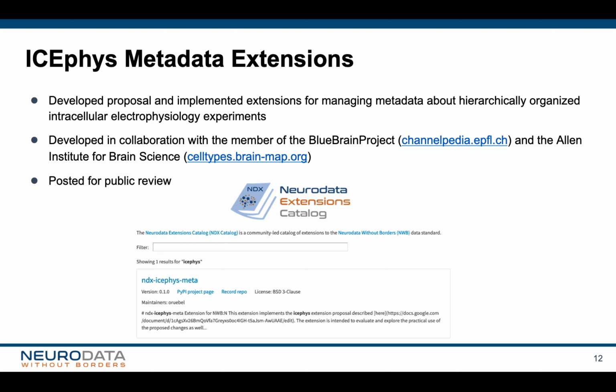The approach we have taken for this is that we developed a proposal and we implemented an extension for managing metadata about the hierarchical organization of intracellular electrophysiology experiments. We developed this extension in collaboration with members of the Blue Brain Project and the Allen Institute for Brain Science, and we also posted it for public review to collect feedback and information from the community. And we also performed a review of the extension during the developer hackathon at the Allen Institute for Brain Science in February of 2020.